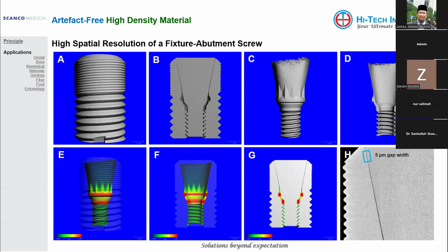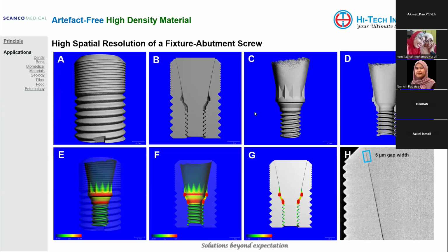Sure. I have a few questions, but let me read from the chat box first. We have Dr. Samiullah. He's asking, can we use this technique to see and research the Haversian system and Volkmann's canal? Yes, you can. The answer is can. Definitely can.